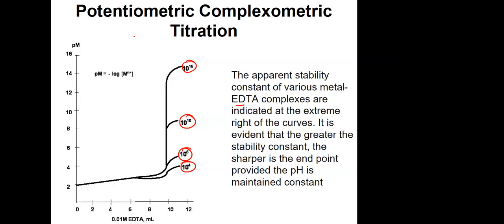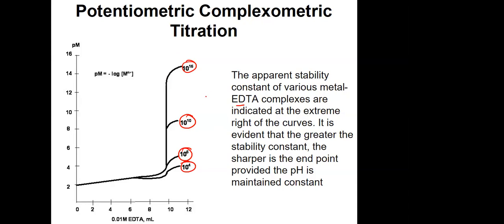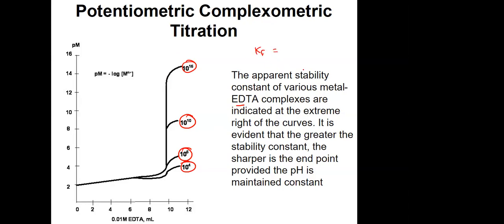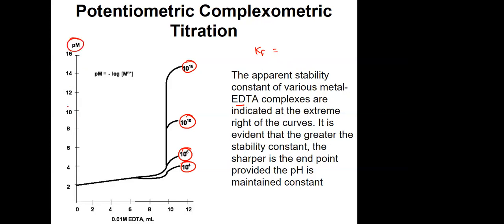Medyo sir, kasi meron pong 4 na ions, copper 2+, Fe3+, manganese, and chromium. Tapos yung plot po nila, ima-match namin. Tapos ang given is KF. Potential po versus volume. Opo sir, parang ganito pong plot, sir.